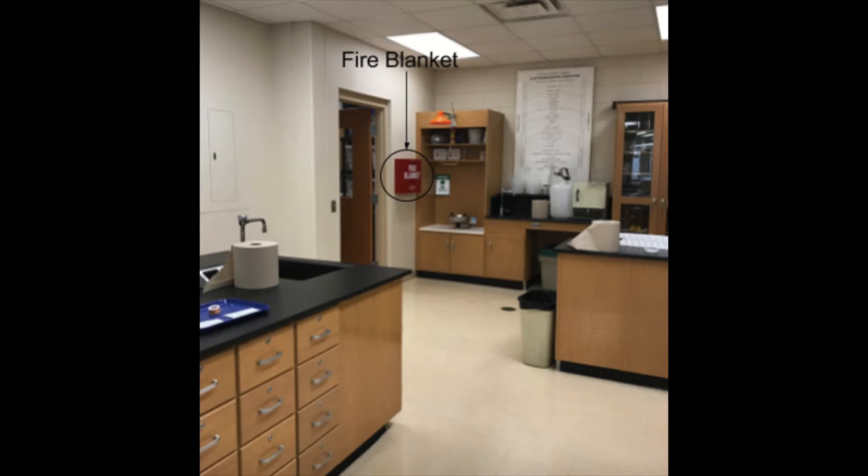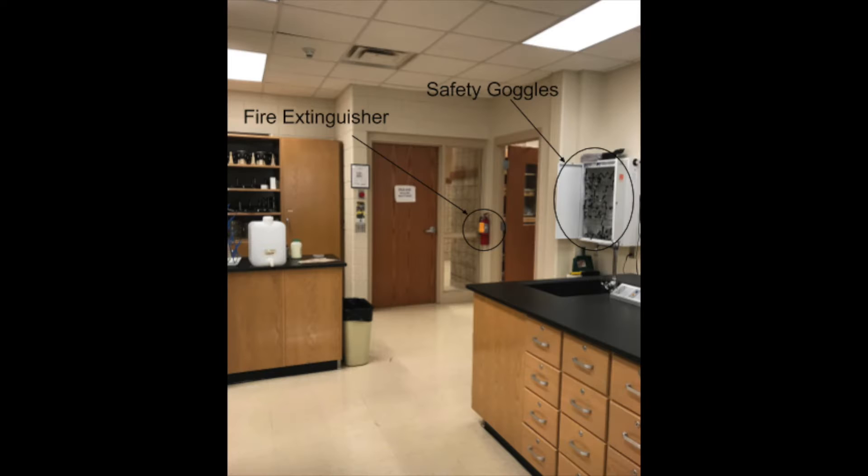From the front of the lab, the fire blanket will be in the back left corner, while the fire extinguisher and safety goggles will be in the back right corner.